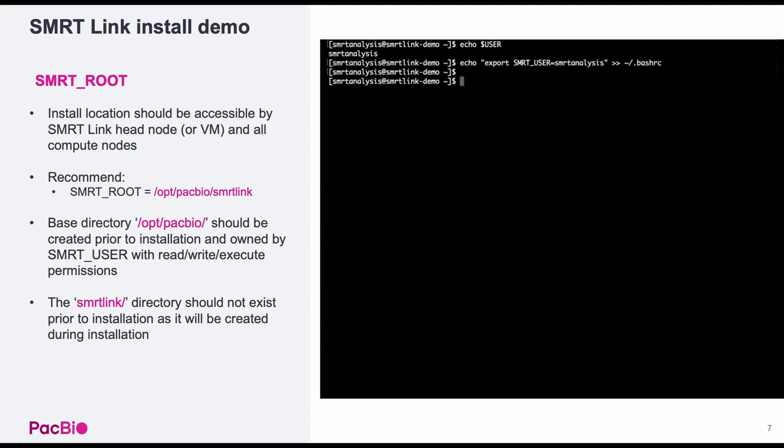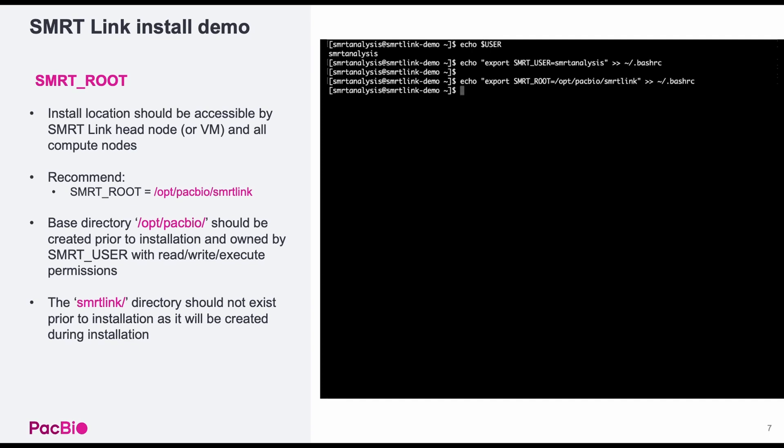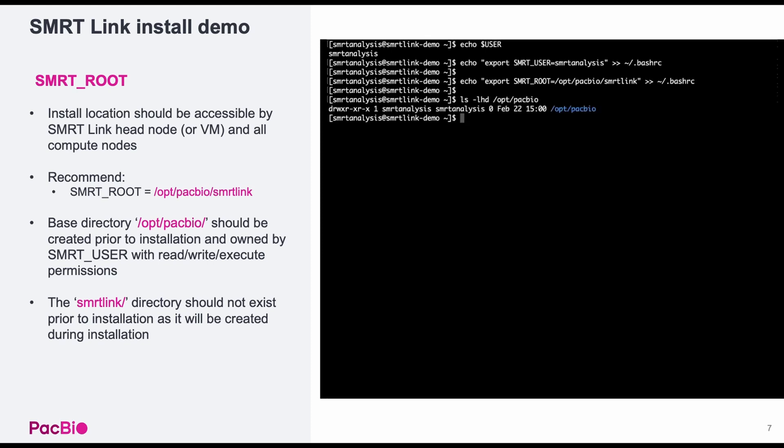Next, we need to decide where to install SmartLink. If you want secondary analysis capabilities, then the install directory needs to be accessible by both the SmartLink head node or virtual machine, as well as by any compute nodes. We recommend setting the installation directory to opt-pack-bio SmartLink and to set a variable named smartroot indicating the installation location for SmartLink. Know that opt-pack-bio directory should be made prior to installation and should be owned by the smart user with read-write-execute permissions.